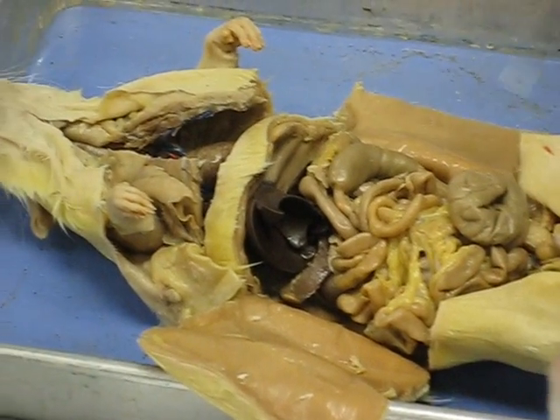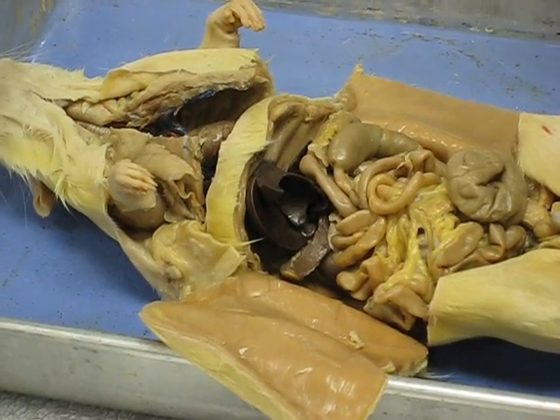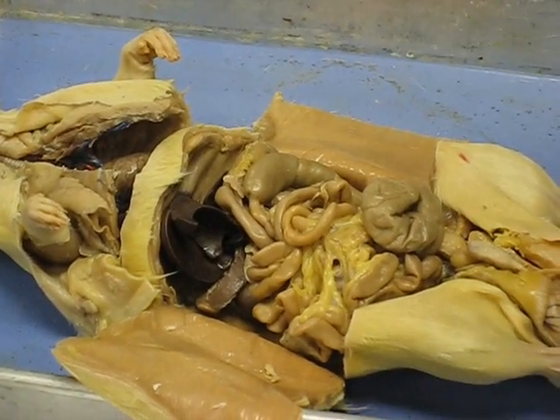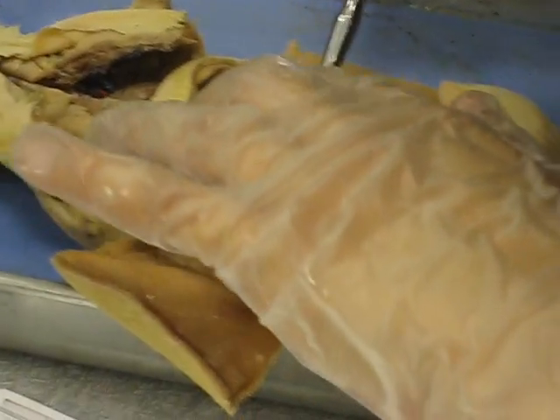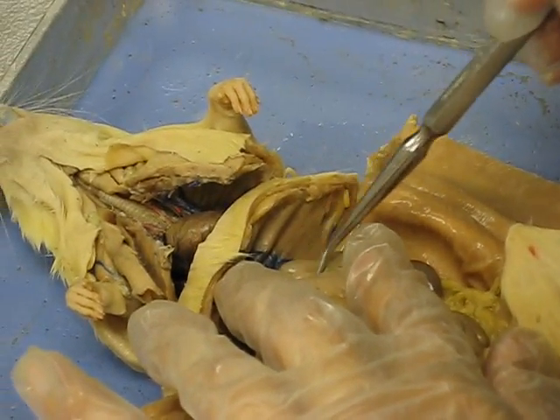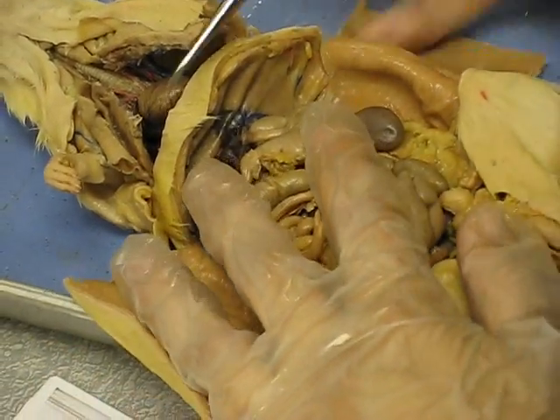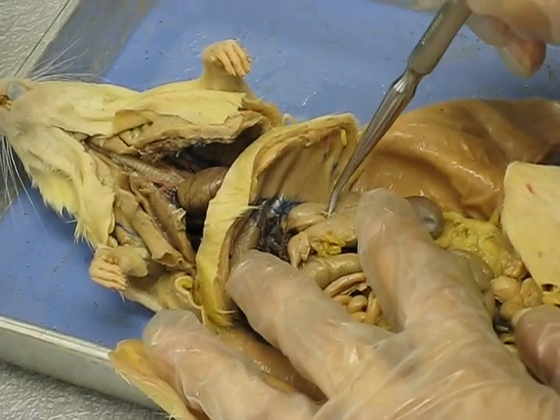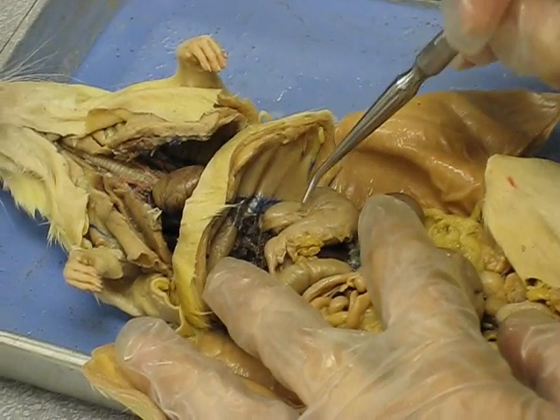There's always biological variation, especially in the veins and arteries — they're not always going to look exactly like the picture or like somebody else's. So you want to make sure you know, okay, this branch comes off from this one; it's not always going to look the same. So we've identified the liver, and here we have the stomach. What is this connecting to the stomach? The esophagus — it's the structure that leads into the stomach. You can see it right there. If you get heartburn, some acid goes back into your esophagus.